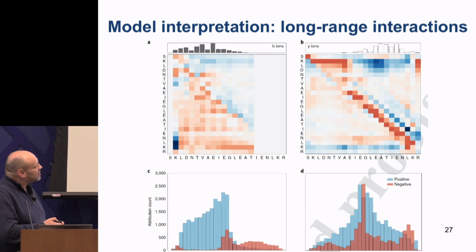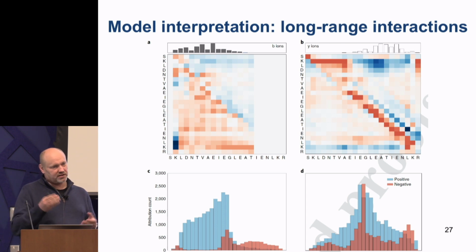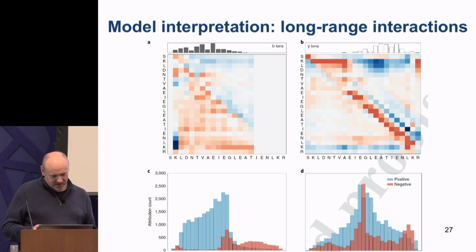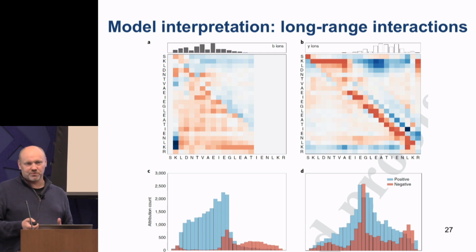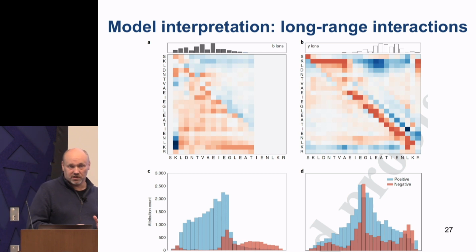Okay, good. One other interesting observation is that this deep learning model is actually highly interpretable. That goes against what you hear all the time, that these are very good at making decisions, but nobody really knows why, and maybe they're going to kill us all or something like this. That's what people think and what's in the newspapers all the time, but that's actually not true. There are new methods, like this one called integrated gradients that just came out of Google, that help you to interpret the model.